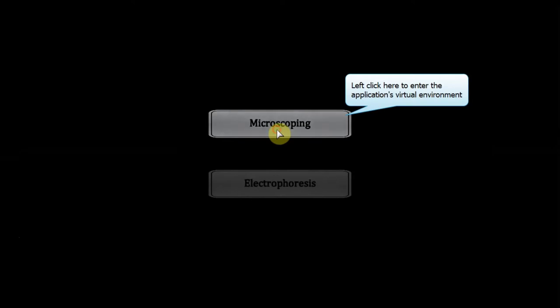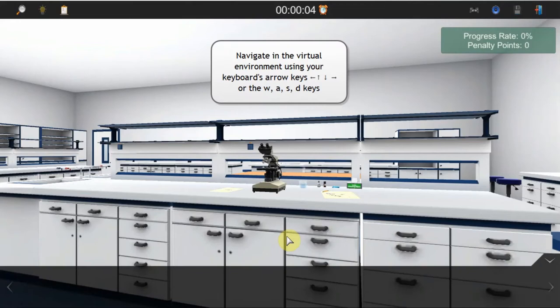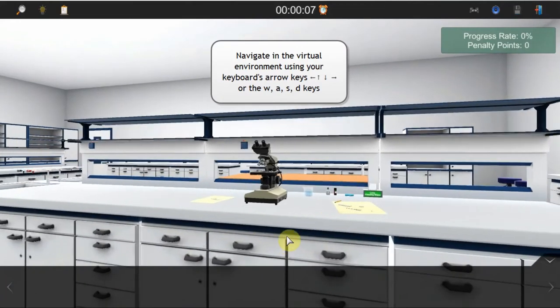Enter the application's virtual environment by left-clicking on the first option on this screen. Once the virtual environment of the laboratory is loaded, use your keyboard's navigation keys, or W, A, S, D keys to navigate to where the optical microscope is placed.